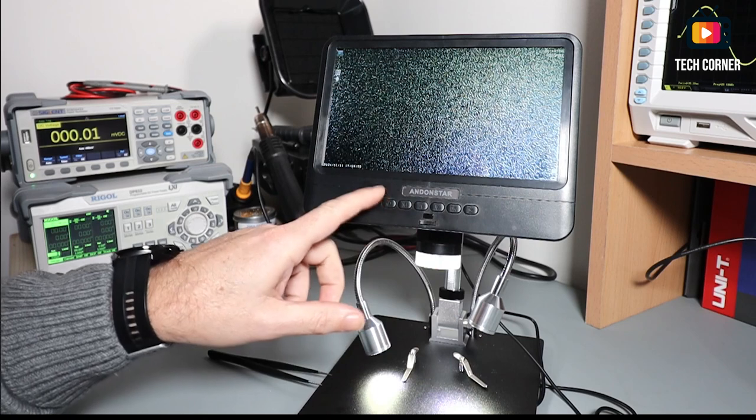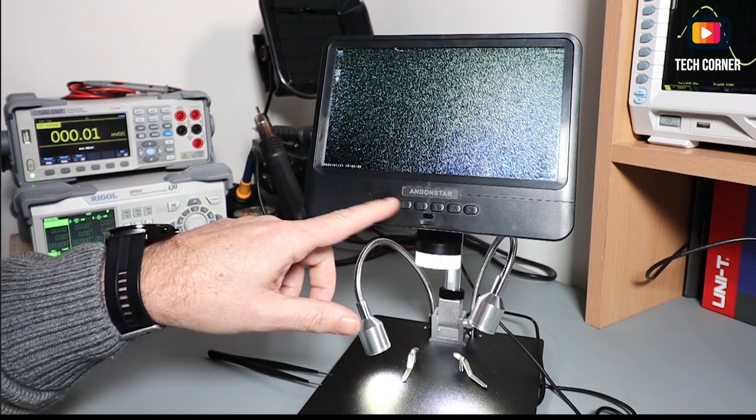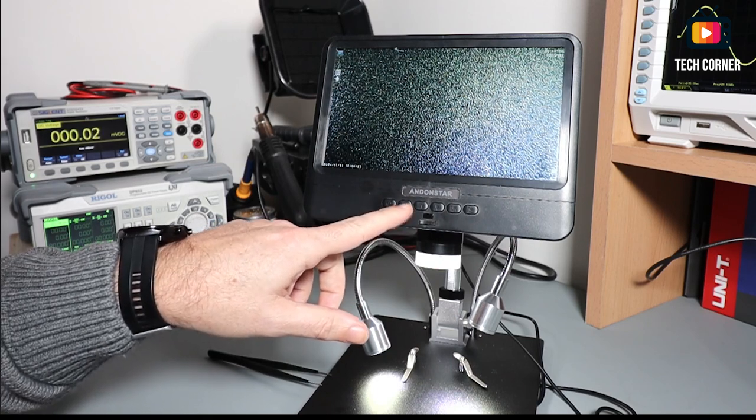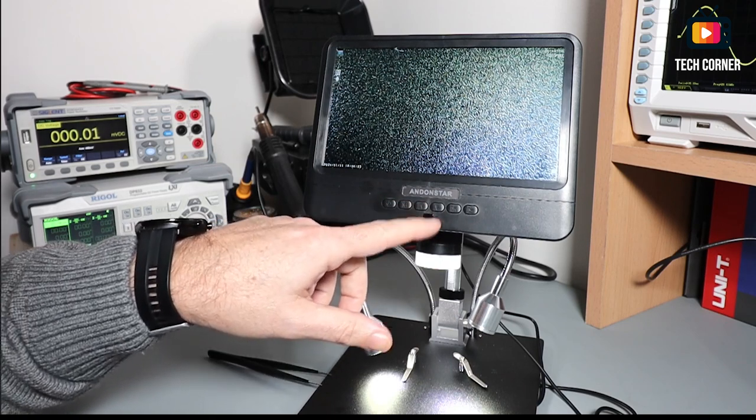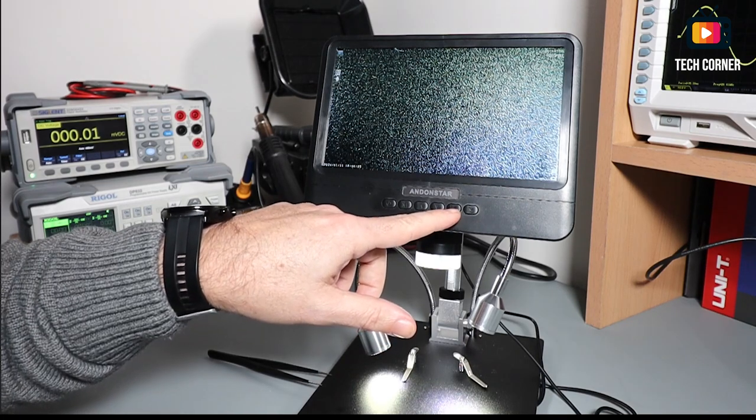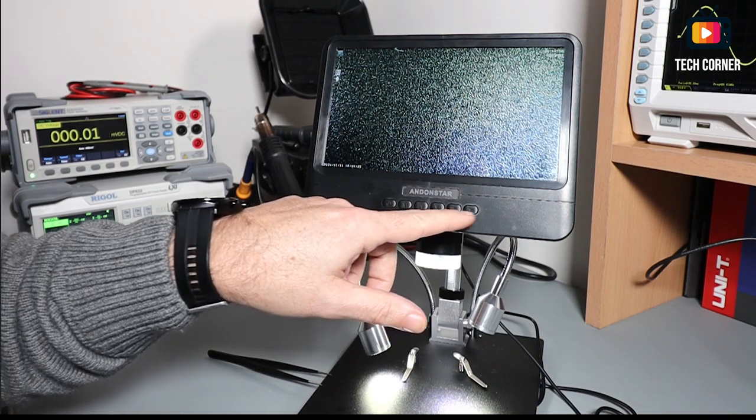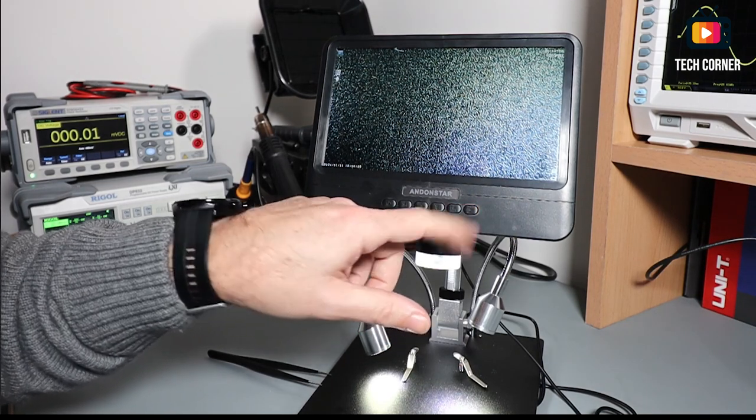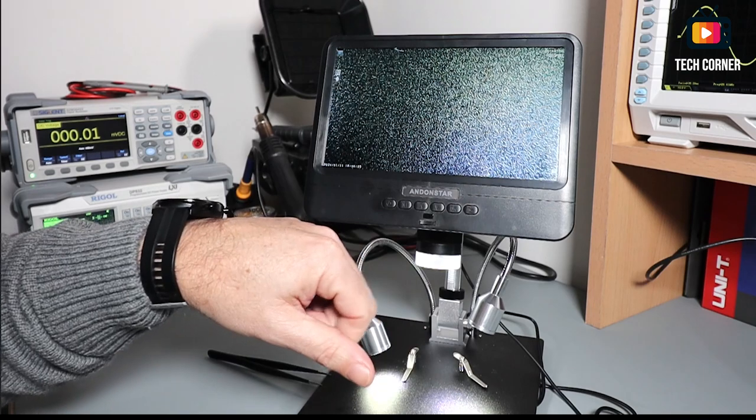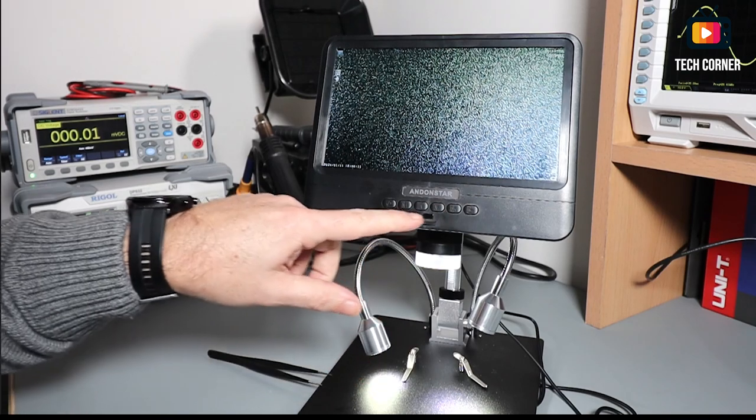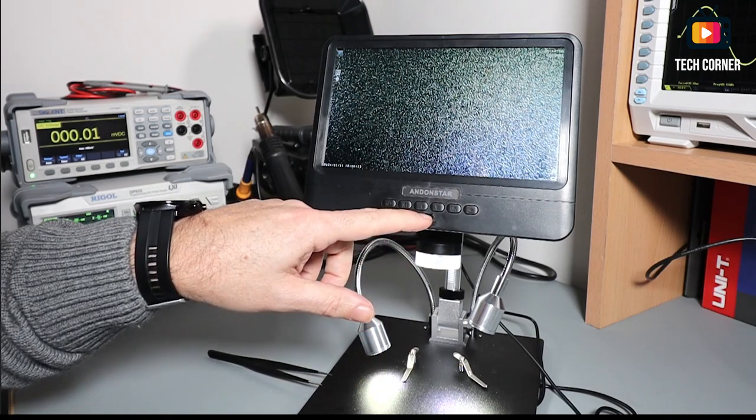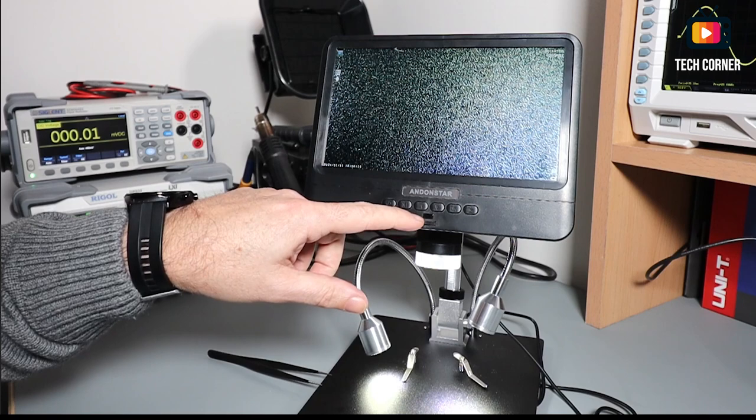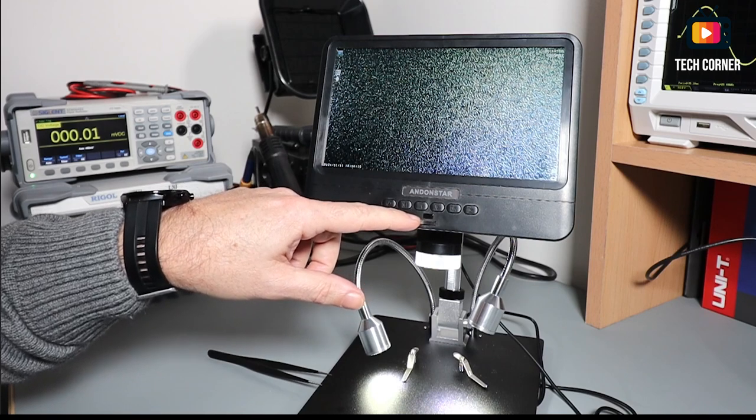We have several buttons here. This is the power button. Also the modes or manual button, up, down. This is for saving. And picture button. I believe this can be controlled also by a remote. It has here an infrared sensor.